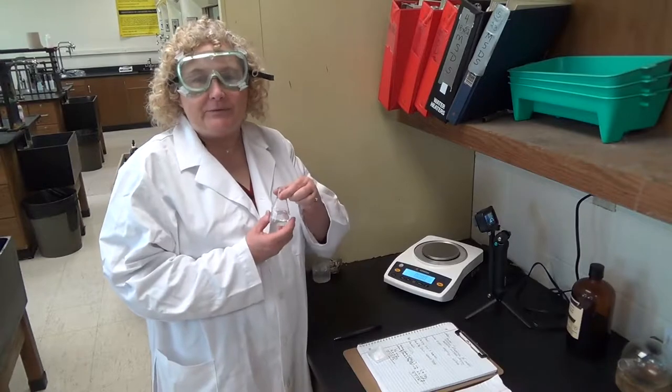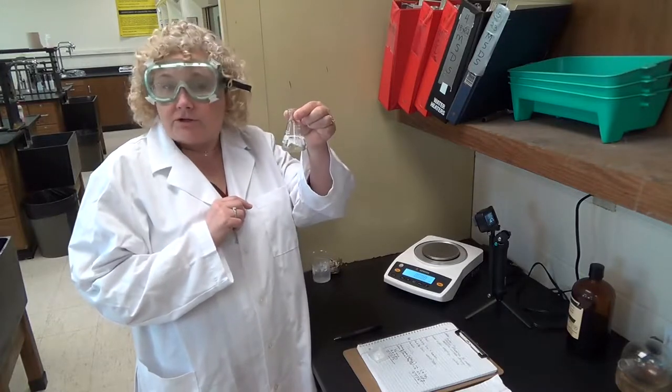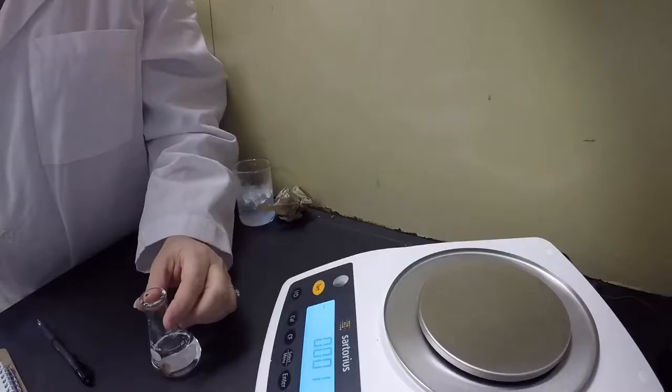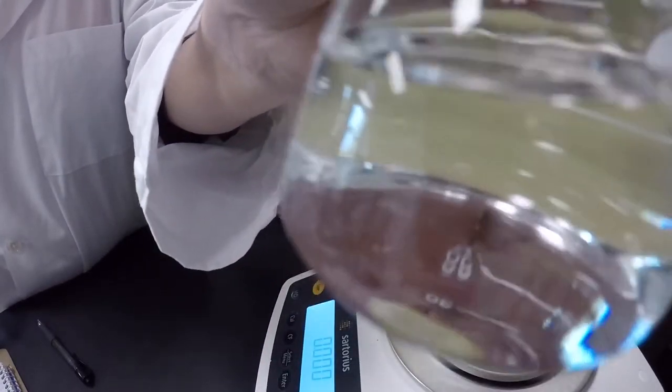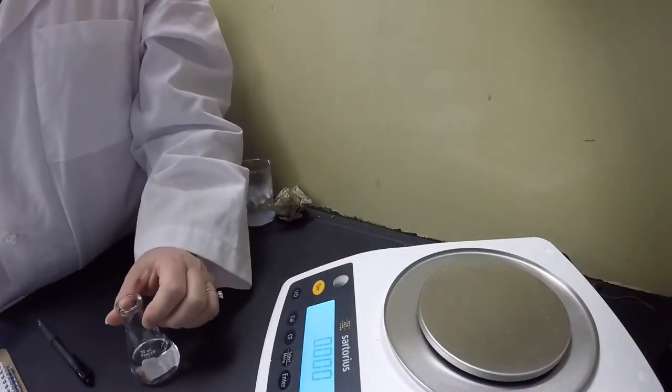Okay, so once again we are examining the properties, examining what happens when we change matter. Here in this Erlenmeyer flask, we have a certain volume of water. You can see that up close, that it's just water. It's a clear liquid.